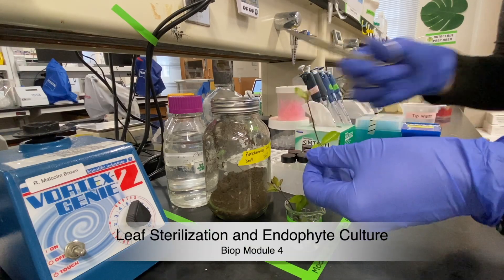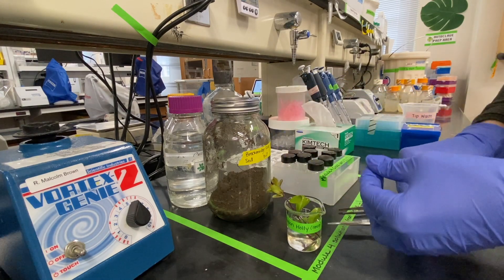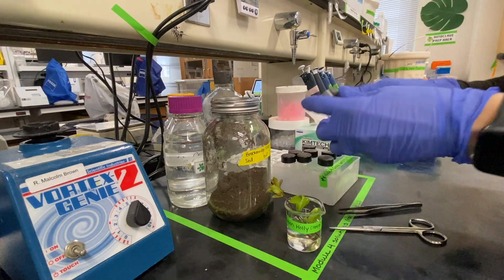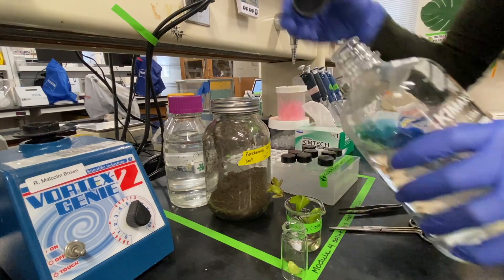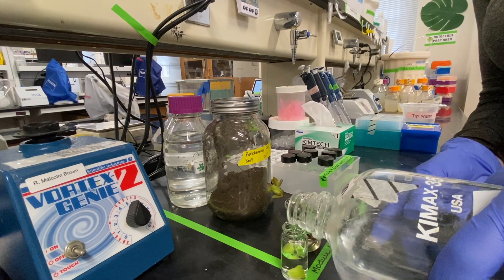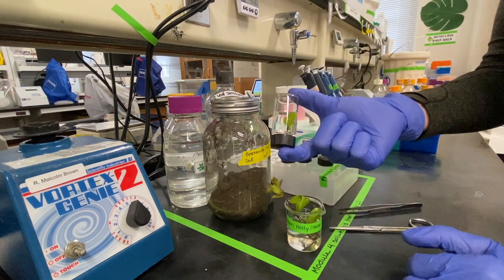We are beginning our leaf sterilization for endophyte culture by selecting a leaf from the holly plants available on the bench. We're going to clip that leaf off and place it into one of the glass vials provided. Go ahead and fill that vial up halfway with leaf sterilization solution. It doesn't have to be exact, and you will gently agitate it for approximately 10 minutes.